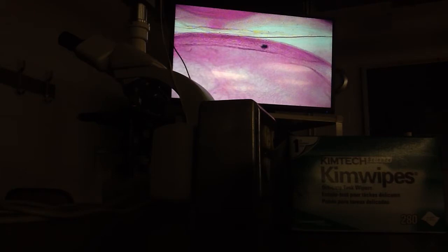That promoter is active when the kidney formation occurs. You saw all of those developing ducts, beautiful green color, because the appropriate mechanism for activating that gene is present. It has the correct enhancers, and it has the correct transcription factors to do what's necessary to make the green come forward. Okay, sir, may we see cross-section of 72 hours?